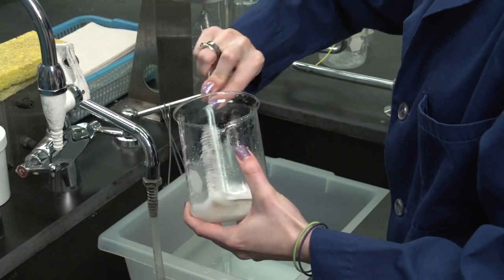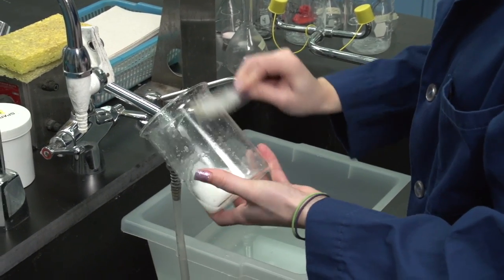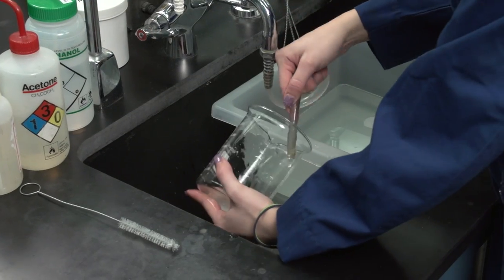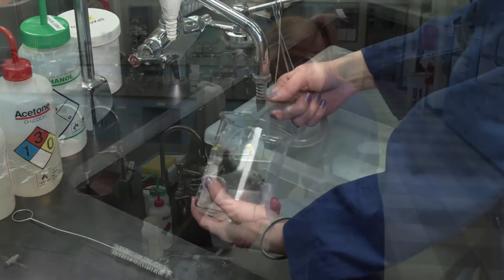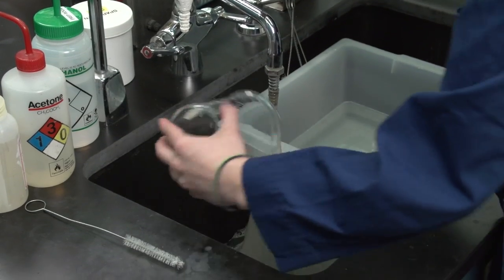General laboratory glassware should be scrubbed inside and out with the available laboratory detergent and brushes, and thoroughly rinsed with tap water to remove cleaners. Finally, glassware should be rinsed with a small amount of distilled or deionized water.